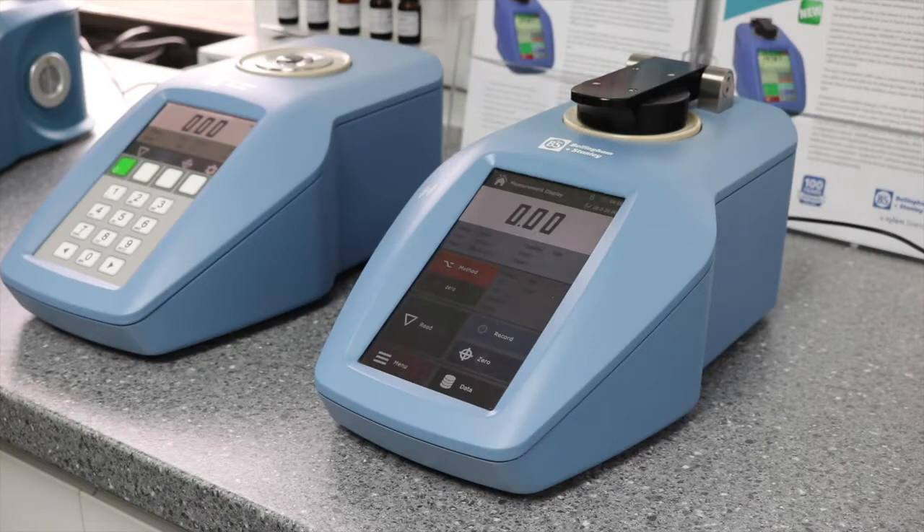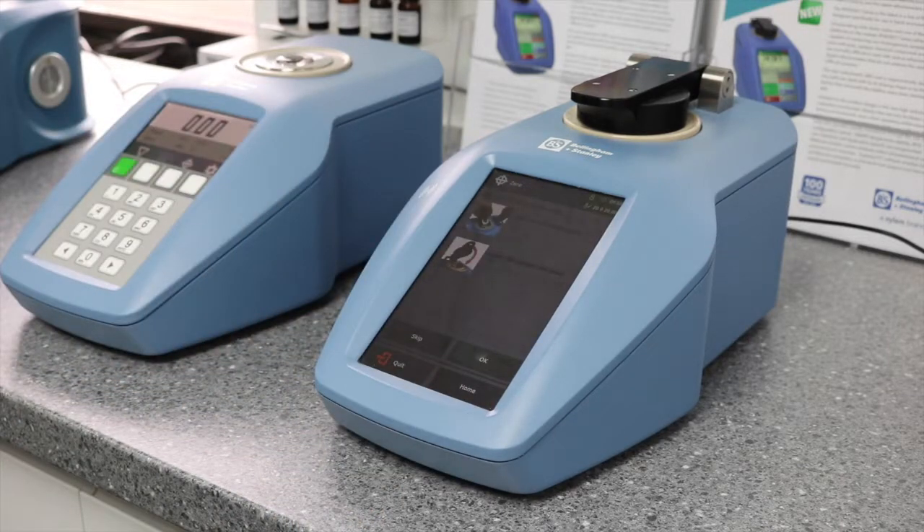How to zero the RFM300T Refractometer. Press the zero button and follow the on-screen instructions.